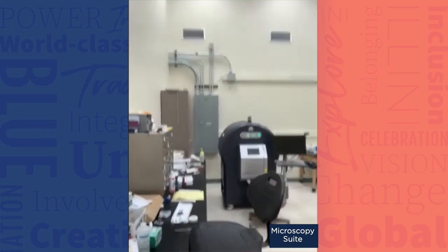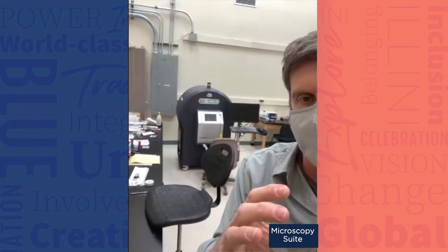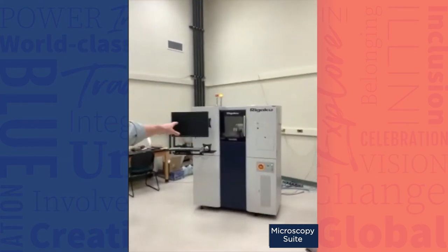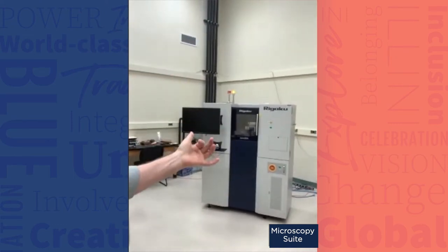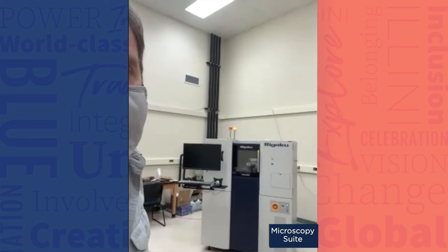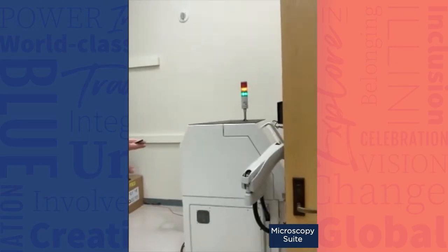Now we're going into the micro-CT area. In this space we have a CT Lab 130 instrument — in this one the sample is static, whereas in every other one of these systems the sample moves. This is a Rigaku system — a Rigaku Nano 3DX — and this one gets about 170 nanometer resolution, so really pretty good resolution. But when we give you these great resolution numbers, it's tricky to achieve that in practice, so we just roll out these numbers but it's not always as easy as it sounds.